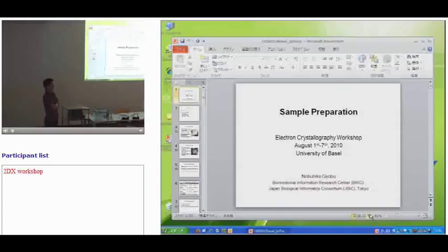So on one side you can purify the crystals from the precipitate and the empty lipid vesicles with a sucrose gradient. In the literature, it was done for the rhodopsin crystals, and it seemed to work, but only if you can get a lot of crystals can you check them by sucrose gradient.